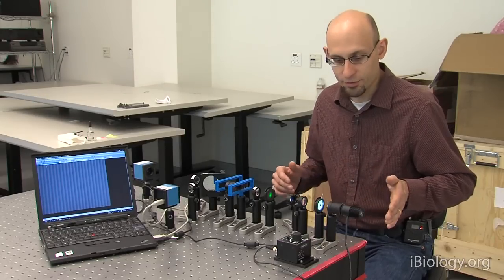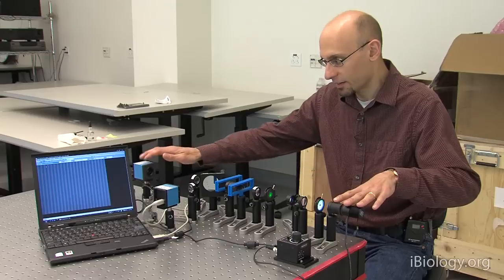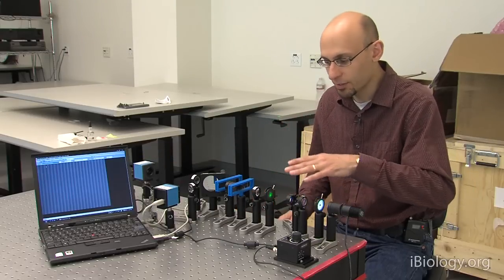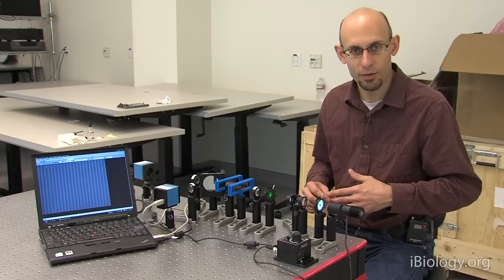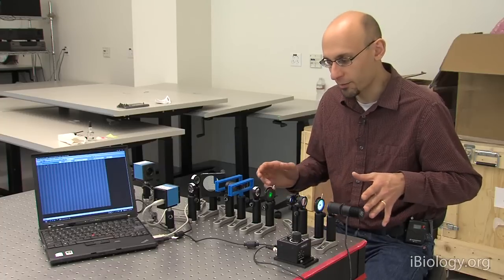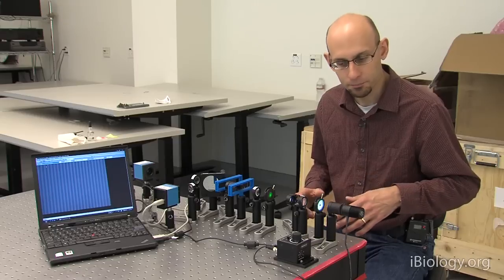What we've got here is a transmitted light microscope. We've got a lamp source on the left here, and then a camera on the right. And the optics between here are all exactly analogous to the optics you would see in a conventional research microscope. And I'll walk through them now from left to right, illustrating what each optic is and what it's doing.